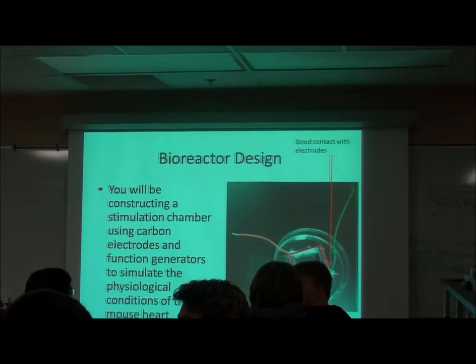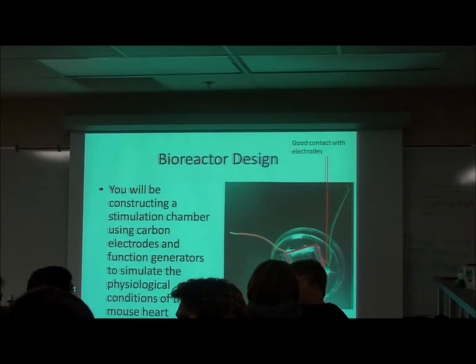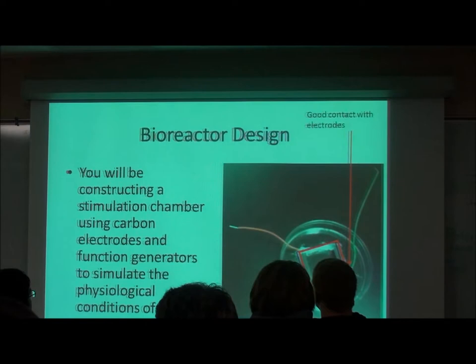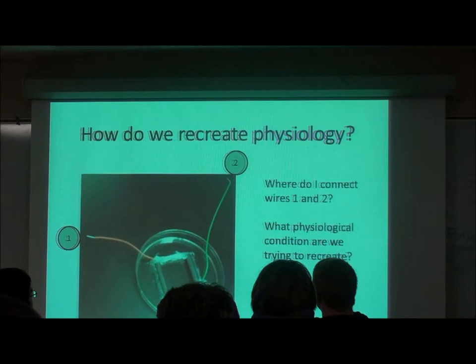The carbon rods have little tips at the end where they taper off and they're very fragile, so be careful. If you can wrap around those, that's ideal because then you can coat it in the silicone and really insulate it. Those are the three keys to a successful bioreactor: really good contact, watertight seals, and good placement of the electrodes.